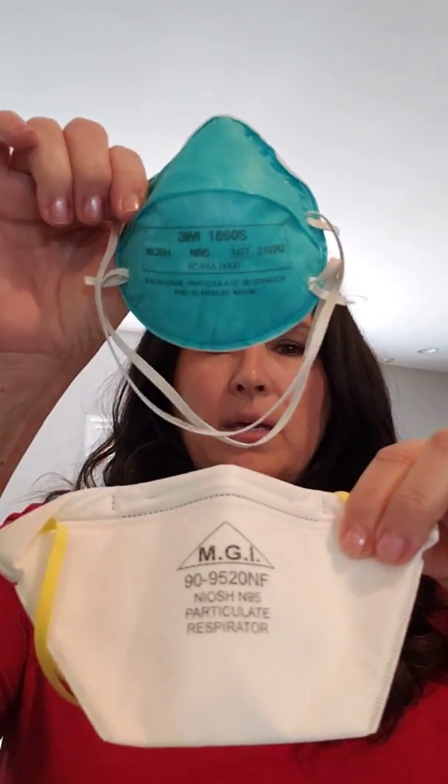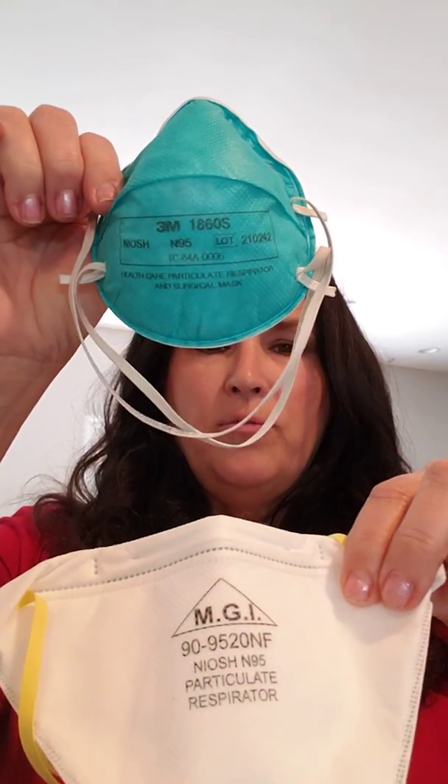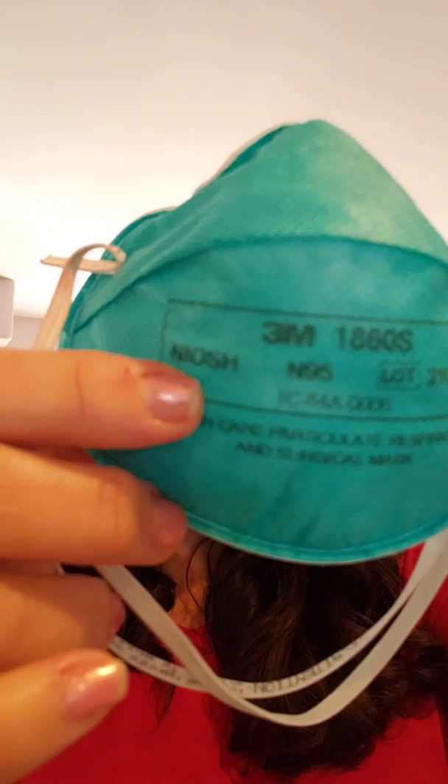There are several different styles of masks — here are just a couple. One is more of a formed style and one is a bit softer. If you look at the mask, you'll see where it says N95. If it's not stamped with N95, it is not an N95 mask. The other thing that assures the mask is properly manufactured is the designation NIOSH, which stands for National Institute of Occupational Health and Safety. If that is stamped on the mask, it means the mask meets the manufacturing and safety standards for the level of mask you're wearing.